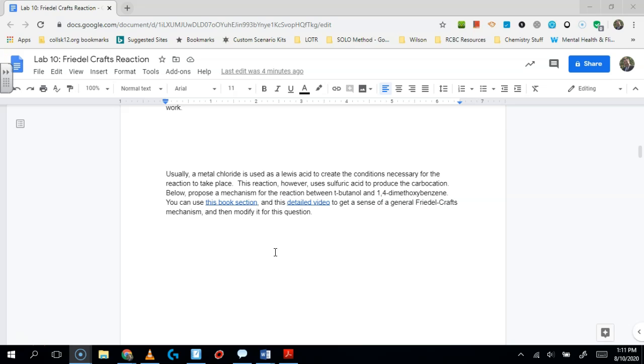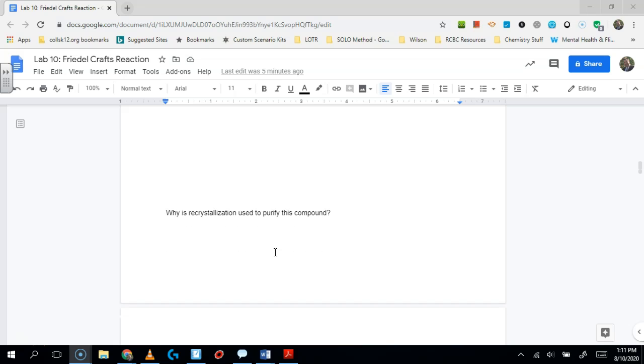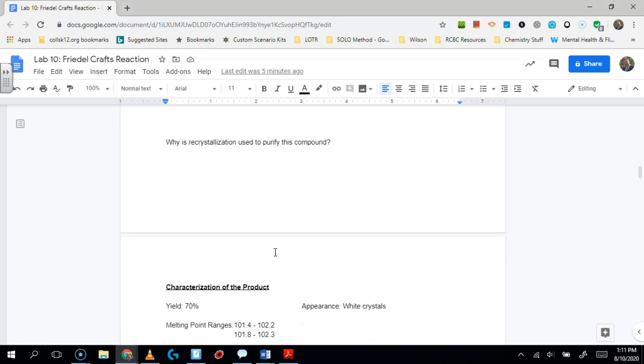I give you a couple of resources. There's a written book and a video on Friedel-Crafts alkylation to get a sense of how it works. Plus you have your general chem notes, plus you have Professor Sherlock, and you have me to ask questions of. So see if you can write a mechanism here, okay? And then at the very end, you're going to recrystallize the compound, and I want to know, why are you going to use recrystallization to purify the compound? So that's a quick answer right there.